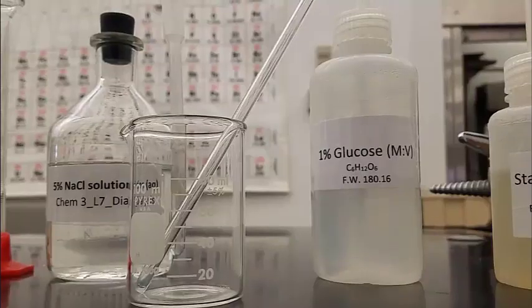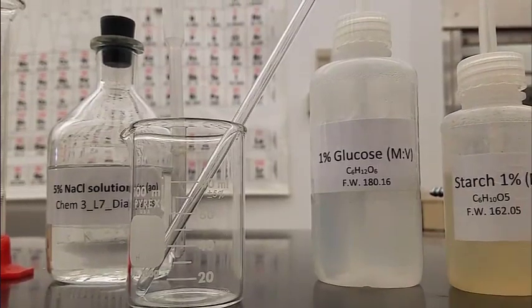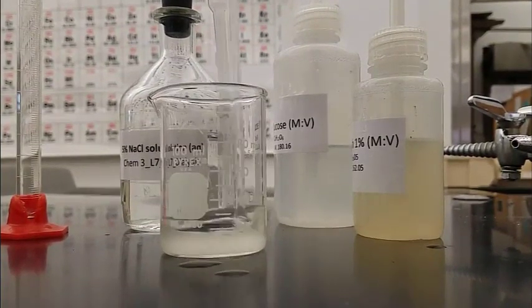We've skipped part A and are jumping to part B. Get your salt, glucose, and starch solutions, five milliliters of each, put them into a beaker, and stir it up.